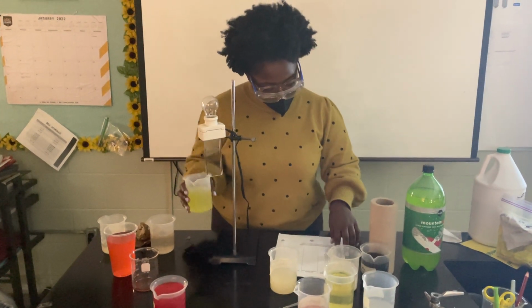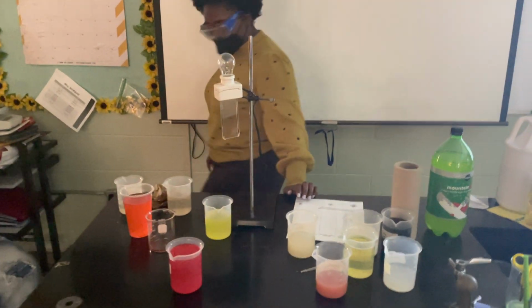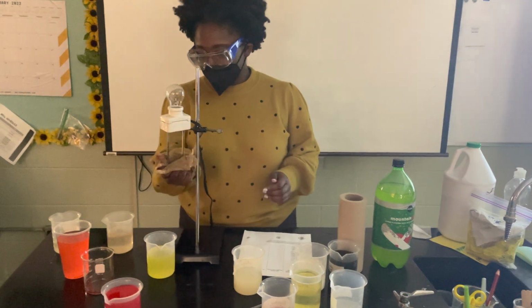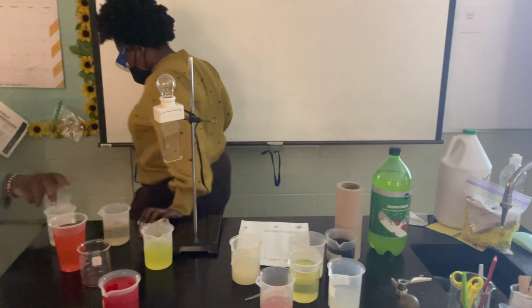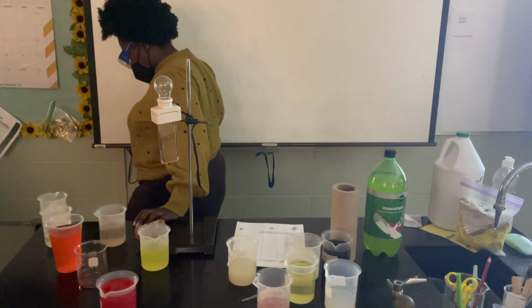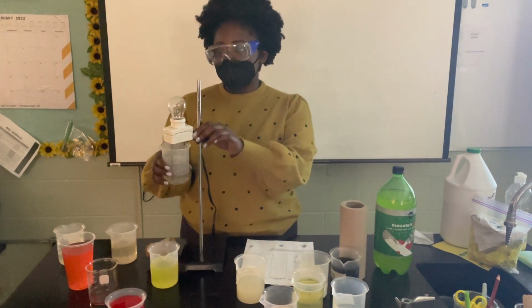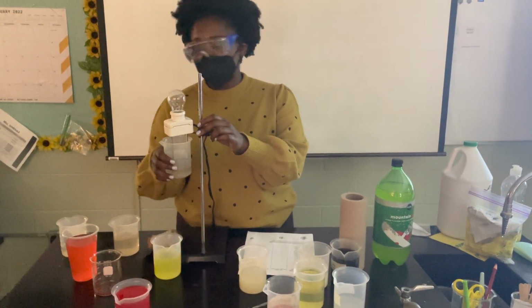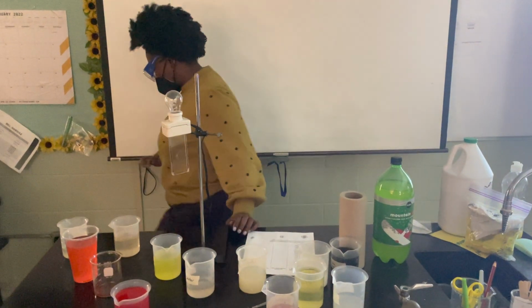All right, let's look at cranberry juice. We do not have cranberry juice, so we're gonna go to the next one. We're gonna go to sugar water. Sugar water. Thank goodness. This is poor. Poor, because it's not lighting at all. Poor conductor of electricity.